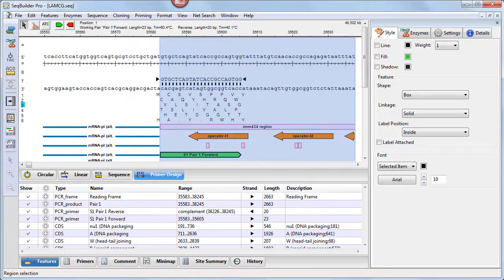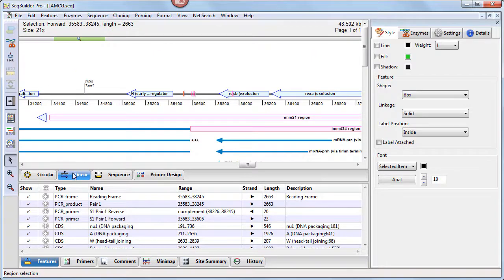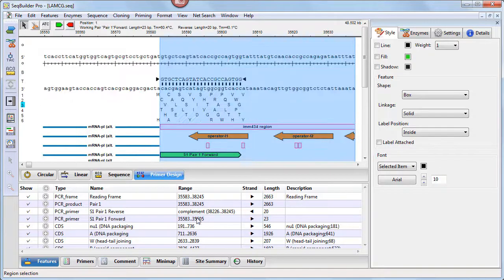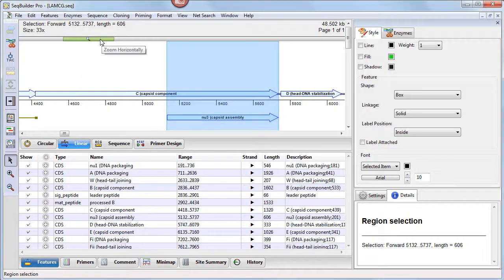Easily navigate between synchronized views and rearrange views and toolbars by dragging and dropping them in the desired locations. SeqBuilder Pro's graphical views, like the linear view shown here, now have sliders for zooming in and out on the image.